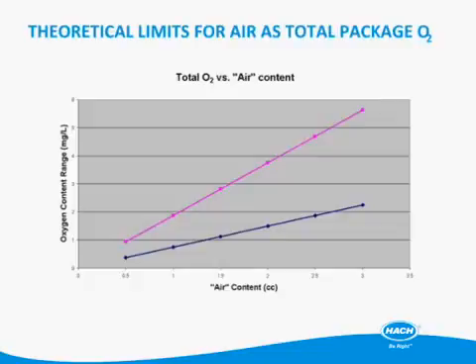And the air measurement can correlate fairly well to headspace air if you do a really good job and follow the ASBC method. The upper line, though, is what you would get if everything was in the liquid. If all that bubble of air was dissolved into the liquid, or what of it would dissolve into the liquid is dissolved in the liquid, then we would get the upper line. And you can see they're completely different. And since that resulting bubble is an unknown O2 ratio between the headspace and the liquid, we end up with a value that really is hard to correlate back to any other kind of a measurement.